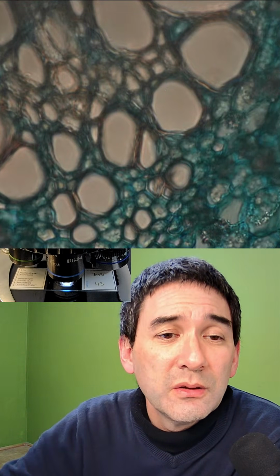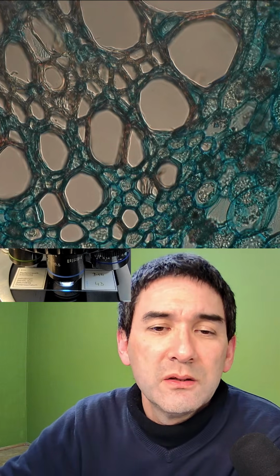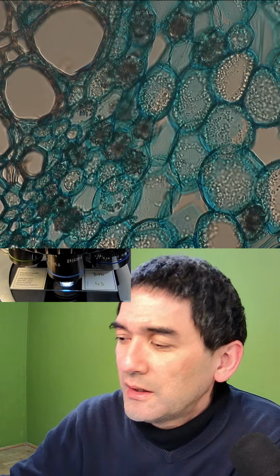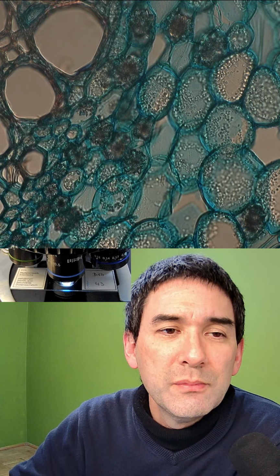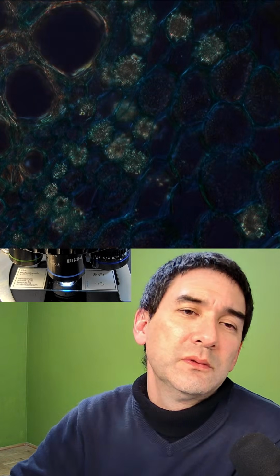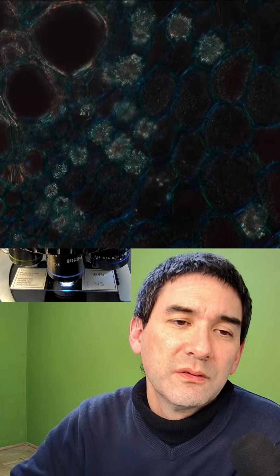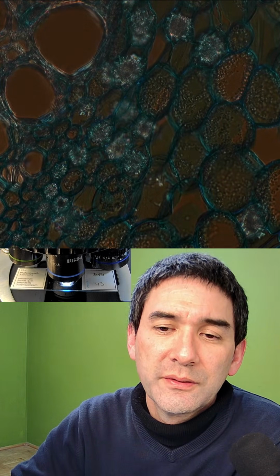So let's have a look here. Let's focus. And that would be now DIC. And you see, there's not a huge difference. I can play around a little bit with the top prism. Over here. Look, this looks interesting. It's almost, maybe there's some crystalline structures in there.